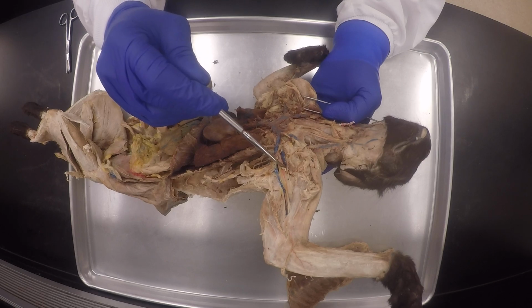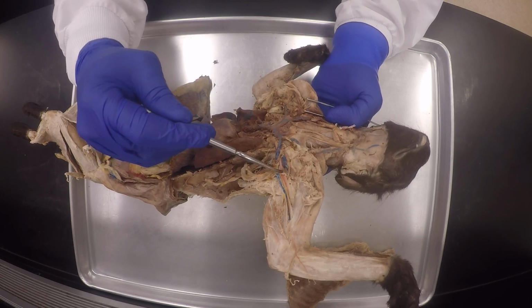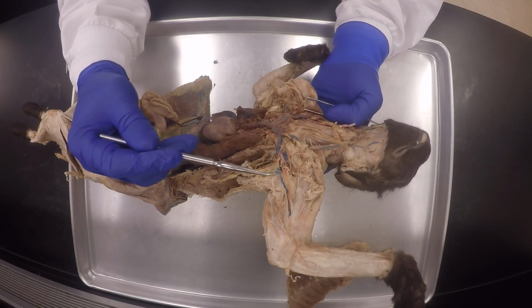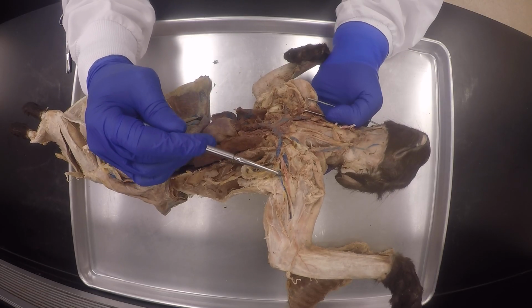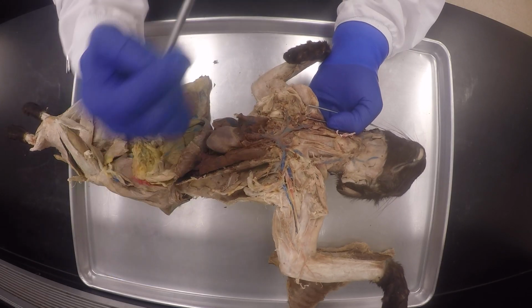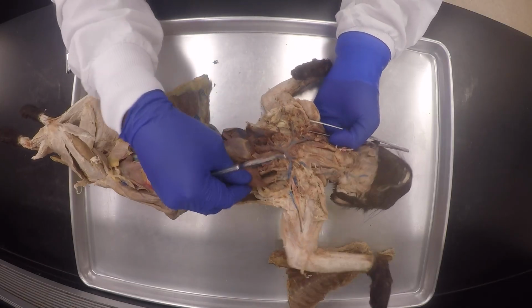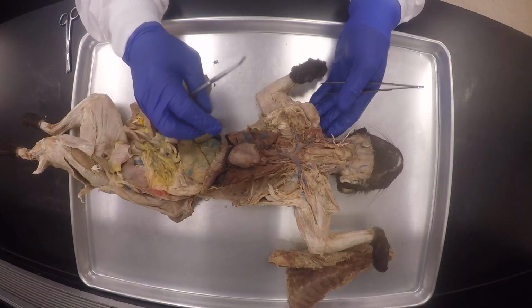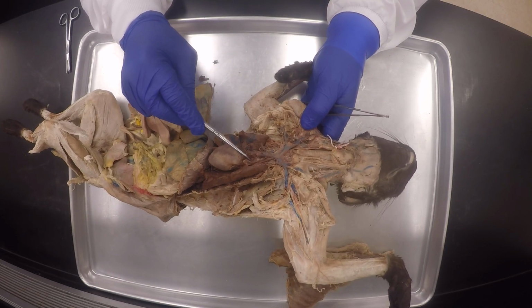And it's also going on this side, you see, because there's the subscapular vein, right, and there's the subscapular artery right there, and then from then on, this is the axillary artery, and then here a brachial artery going that side. I don't think we'll be able to see much of anything else here, but at least we saw the major parts.